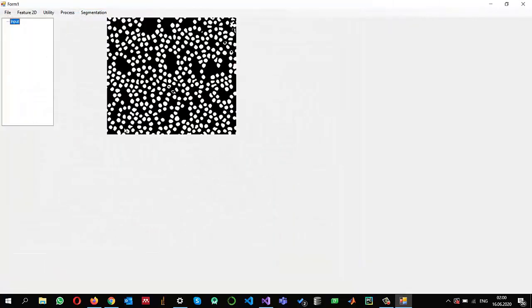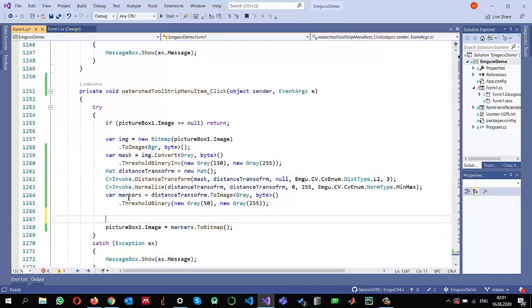This is what I want — these are the markers I will be using for the segmentation. Before passing the markers into the watershed segmentation, I should give each marker a unique value for its pixels, for example 1, 2, 3, 4.